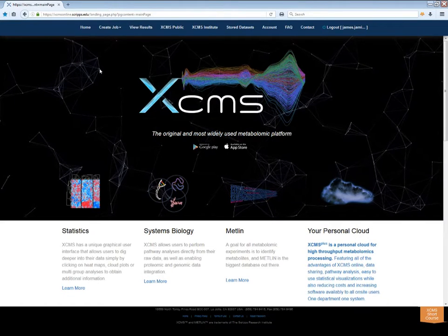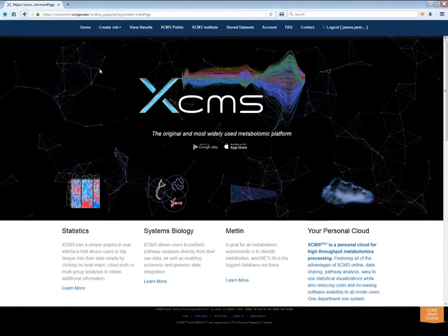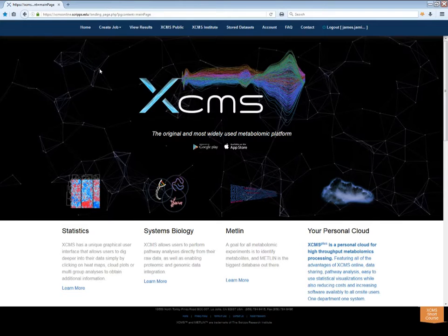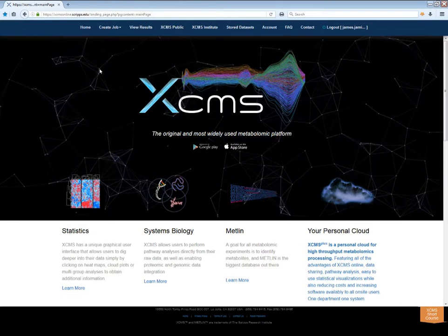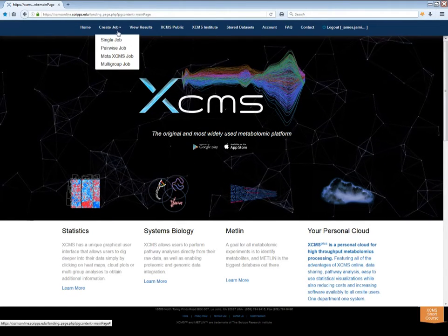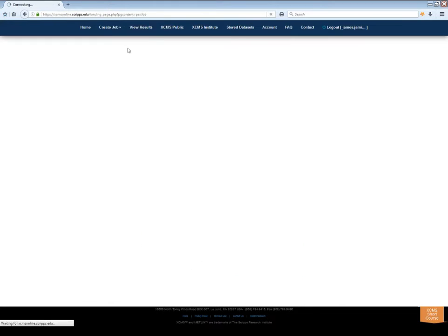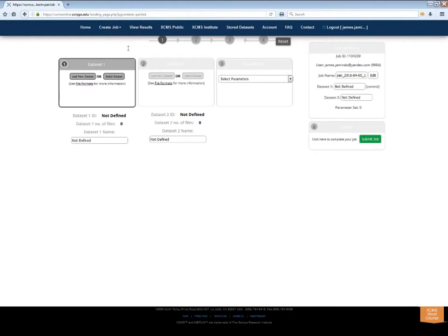Assuming your data is in the correct format, you can immediately start using the system. Click Create Job in the top navigation menu, then select Pairwise Job from the submenu. The step-by-step wizard will walk you through the process of submitting your data for analysis.